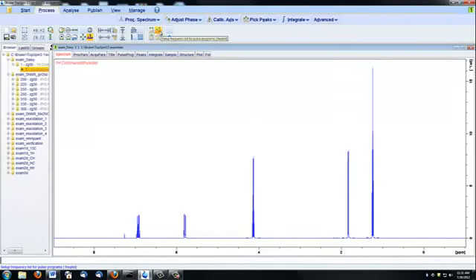Do not click this button. It's not going to help you, and you can potentially ruin your data. Finally, we have the multiple dataset button, and that will be covered in a different video as it's pretty complicated.